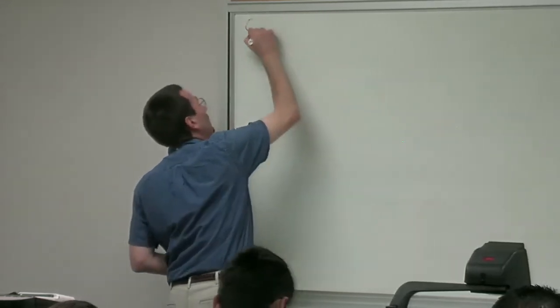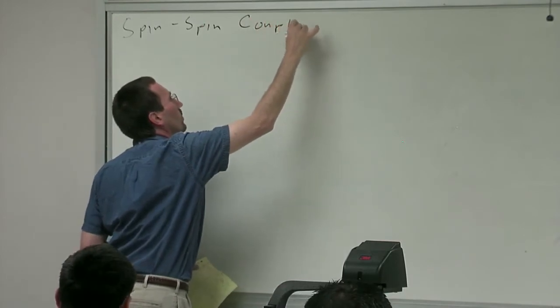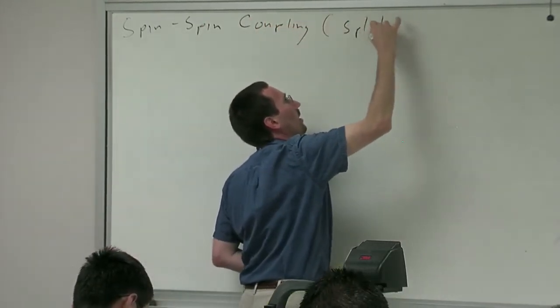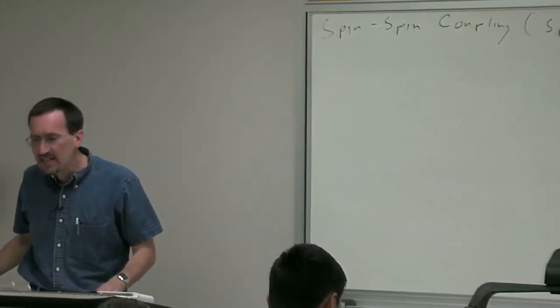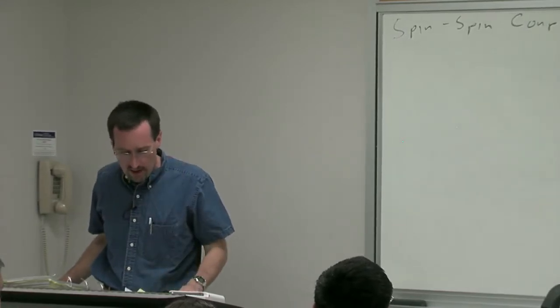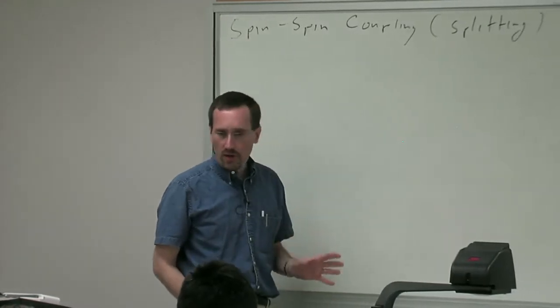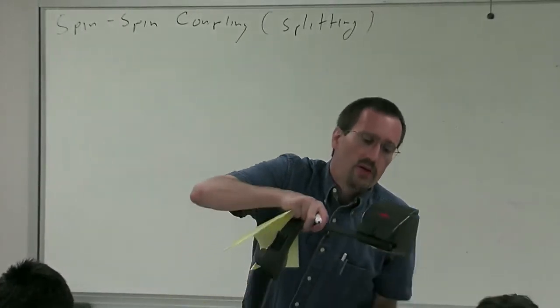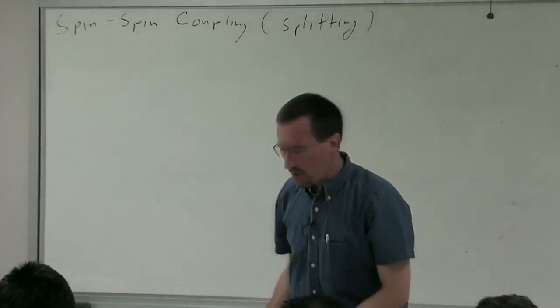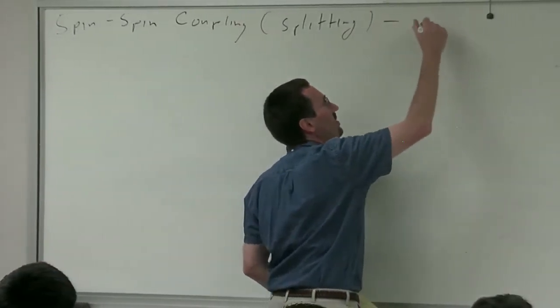All right, I want to talk now about spin-spin coupling, or splitting. And if I had to give you a very, very general way of thinking about it, and we're going to amplify on this in today's talk, the way that I would describe it is that peaks are split by adjacent protons that are different.